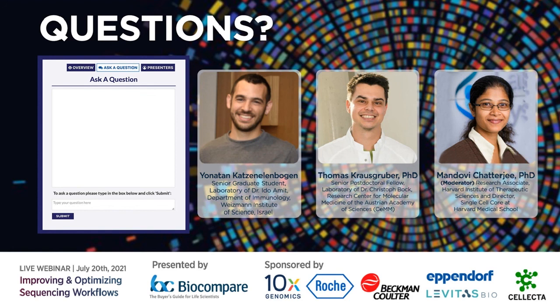There is a good resource in protocols.io, which is a repository of many protocols on many different sample types, which one can consult. Oh, interesting. Protocols.io. Now, of course, BioCompare also has a lot of articles and tech notes and things like that. They are also a useful source.